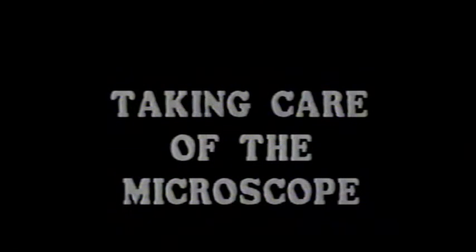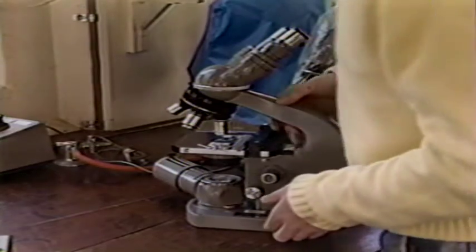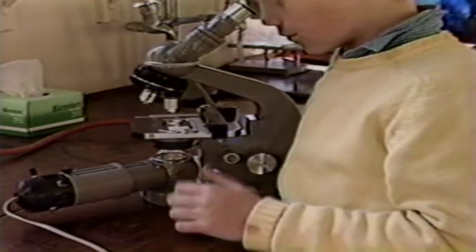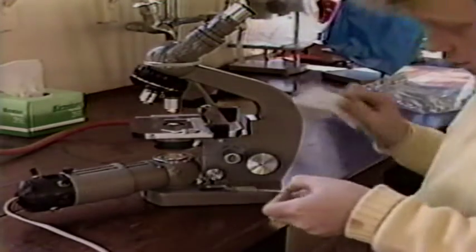The following precautions should be observed when handling and caring for a microscope. First, the microscope should always be lifted with one hand on the pillar arm and the other hand under the base. Fingers should be kept off slides, mirror surfaces, and the ocular lenses.